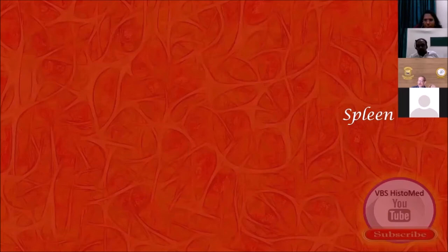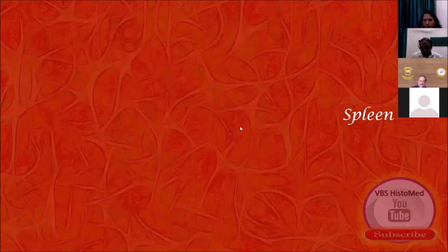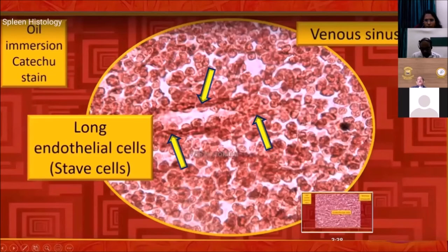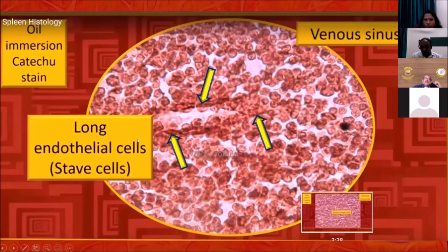Next, spleen. There are certain interesting things in the spleen routinely missed in H&E. I used a special stain and even after using it, I had to search for about two hours to get this photograph. We routinely talk about stave cells and say the ultra-microscopic view may not be routinely visible. I used — if I'm correct — a catechu stain, and with the highest possible resolution without losing clarity, I was able to identify one small area with a venous sinusoid.